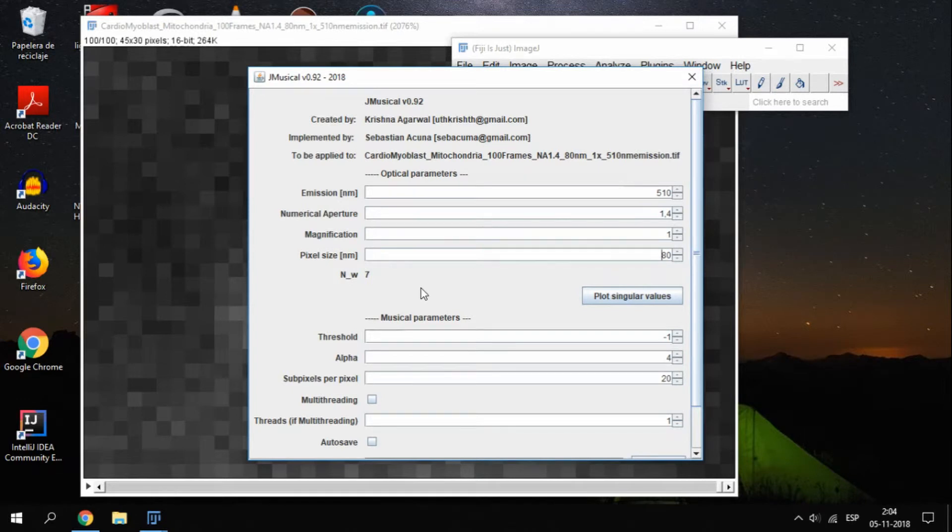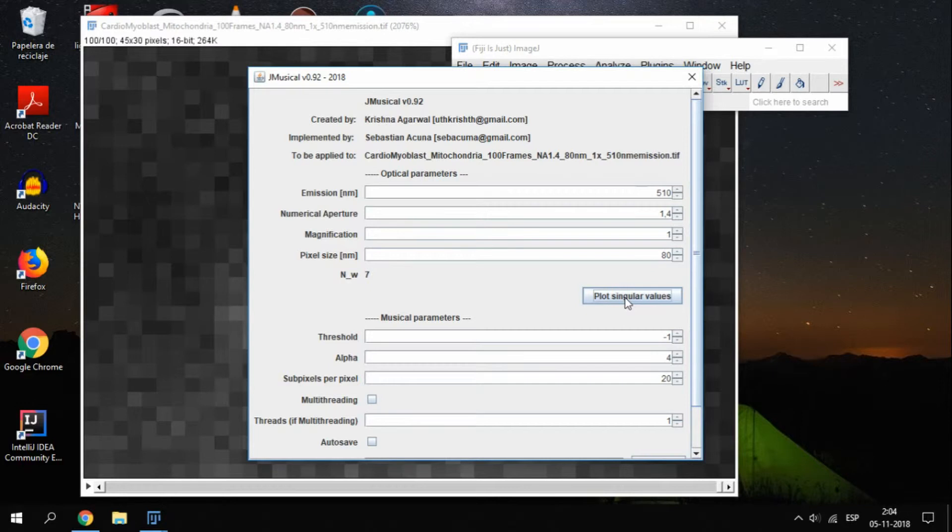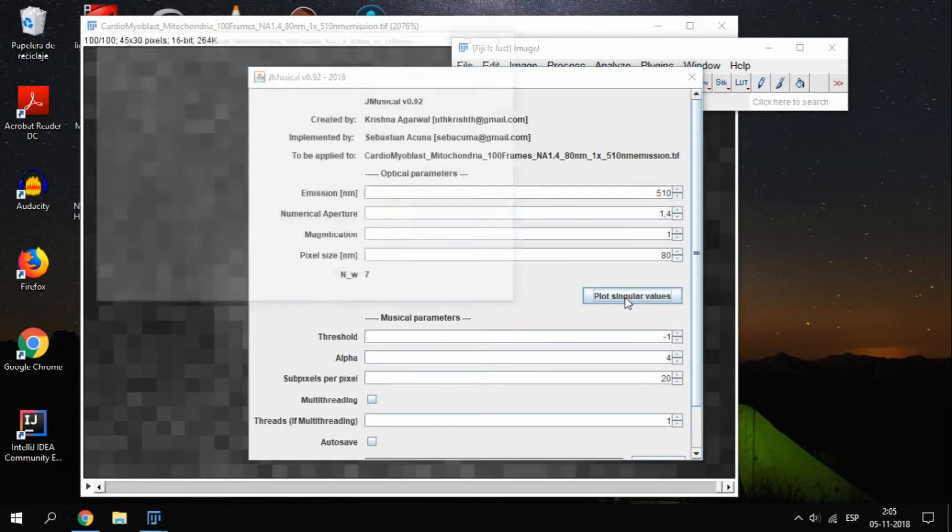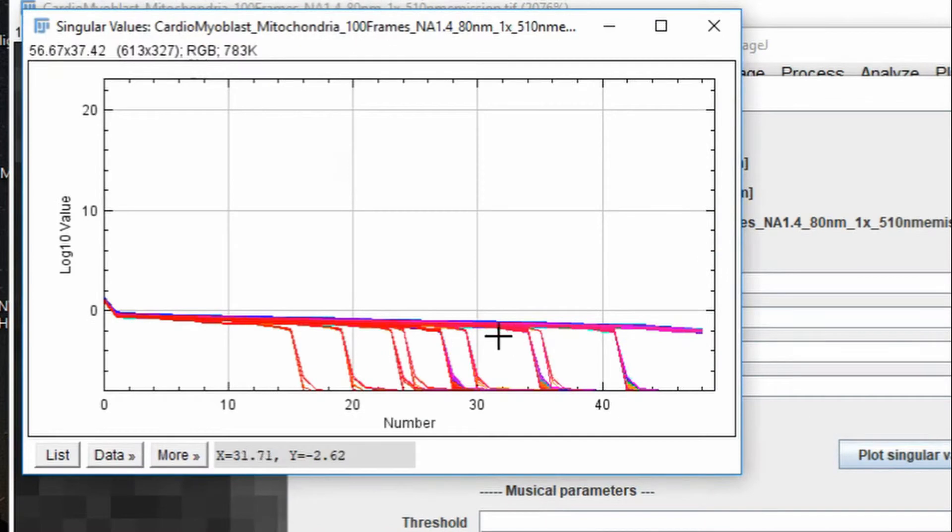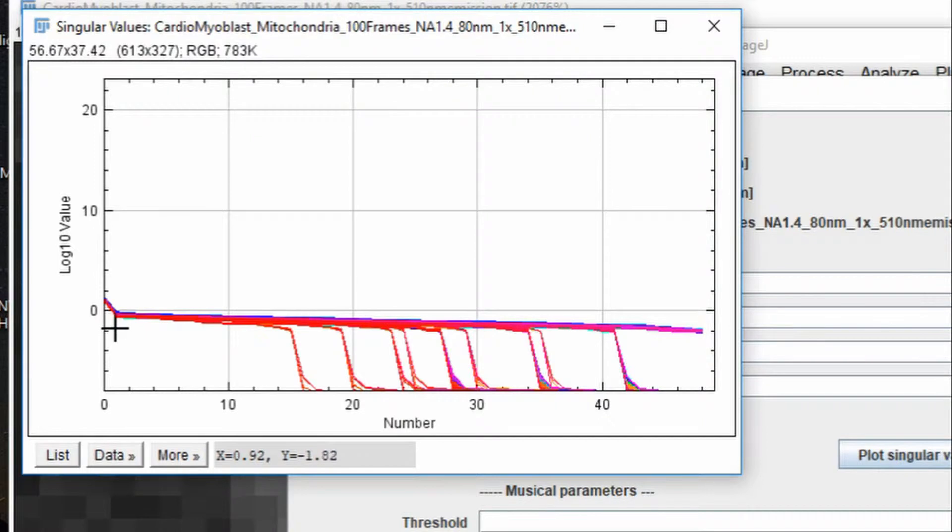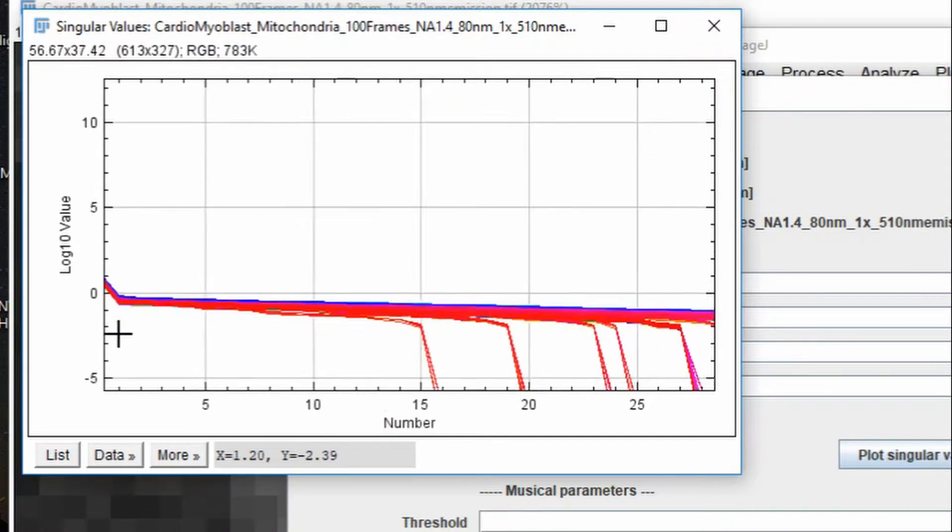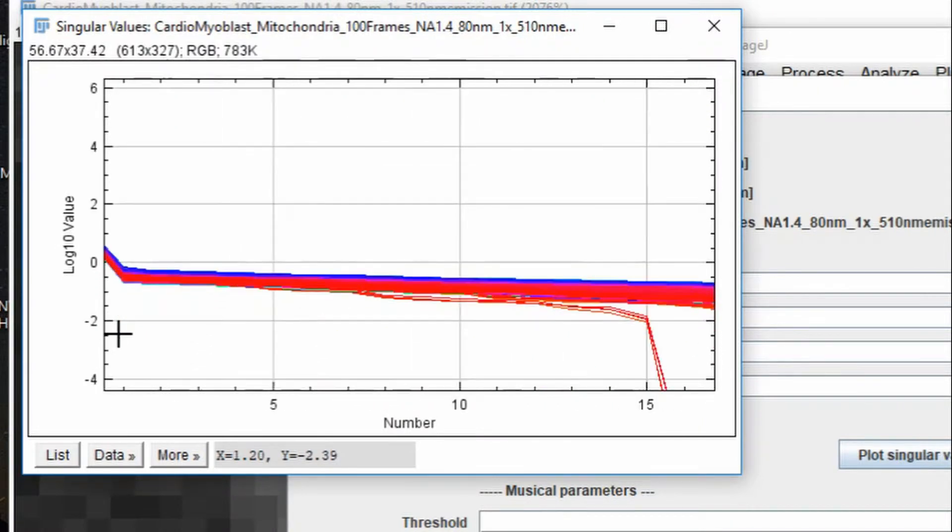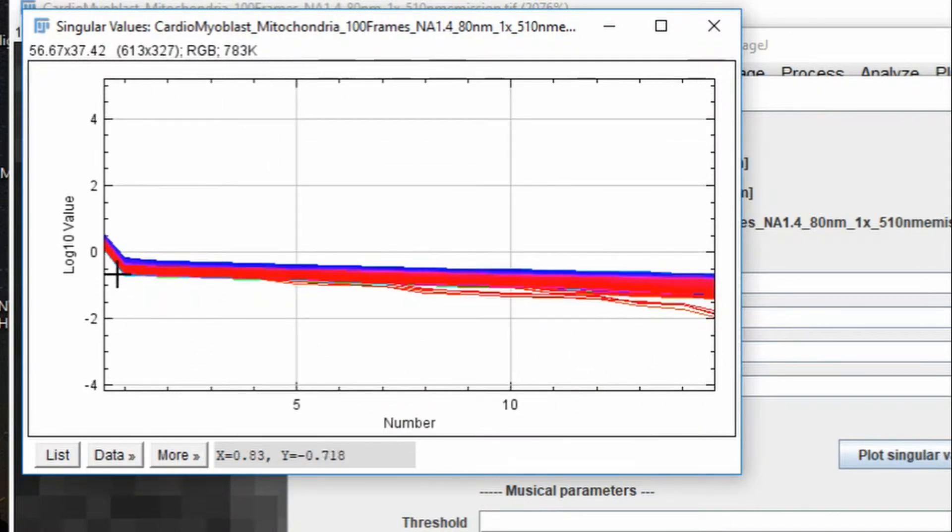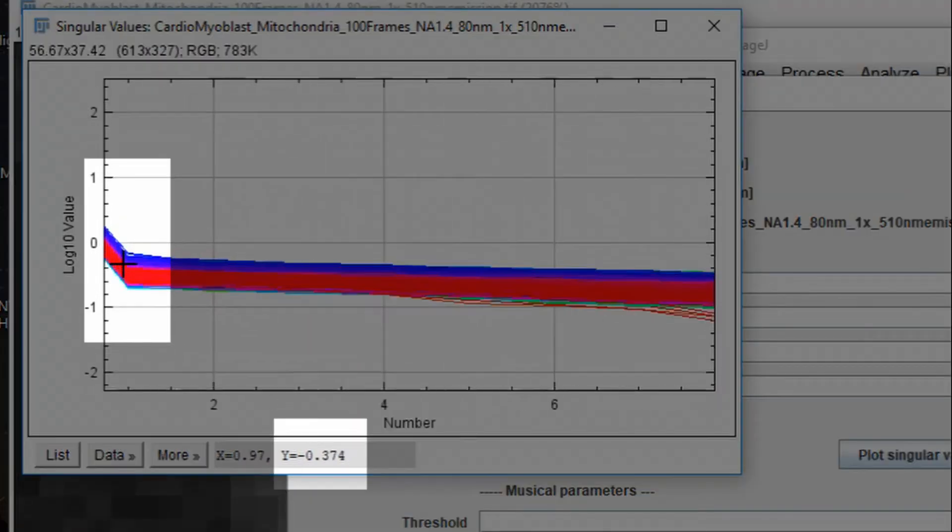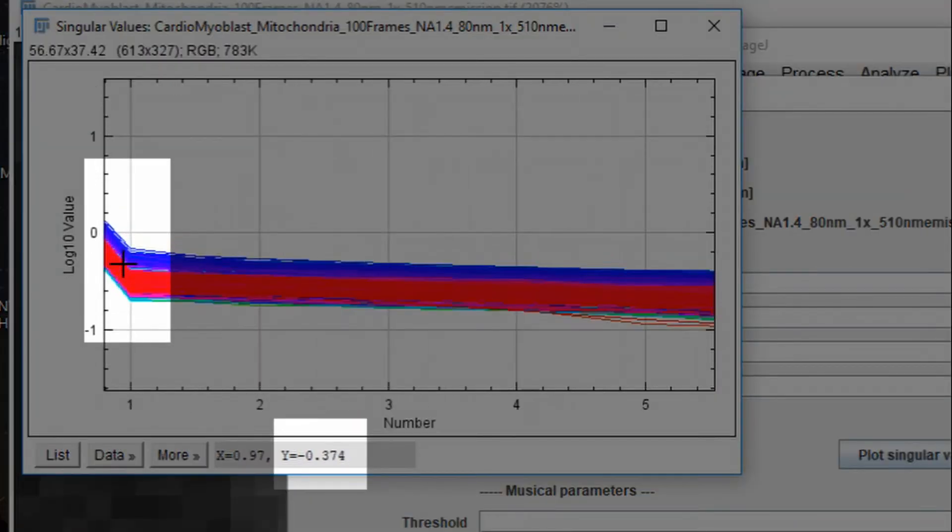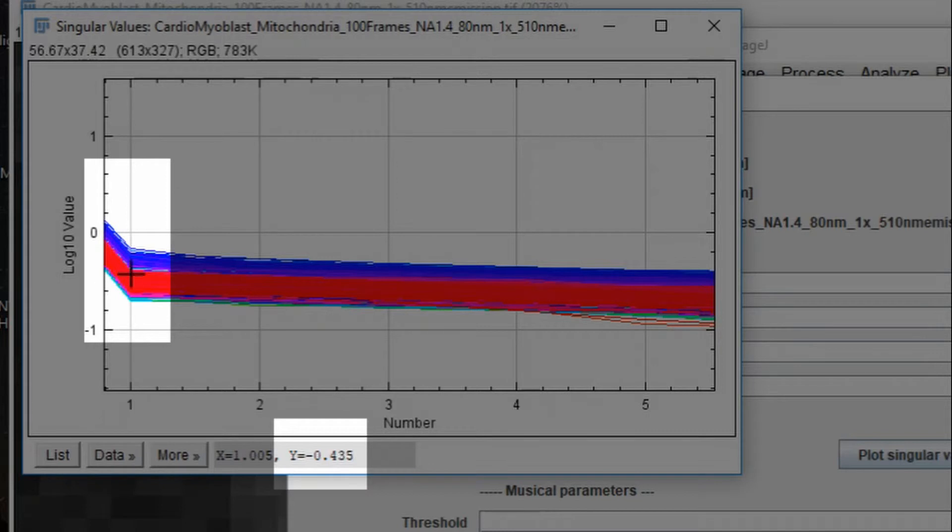After setting these parameters, click on plot singular values. We will use this plot as a tool to obtain the most important parameter for computing the final image, called the threshold. In the plot, we look for the point in which the lines have a big change in direction from vertical to horizontal, the so-called knee point. We are interested in the values on the y-axis, around these curves. The recommendation is to try several of these values around any point, and analyze the result.